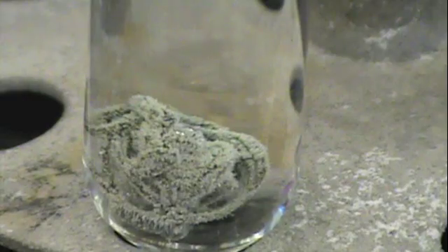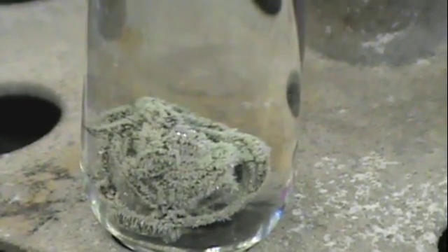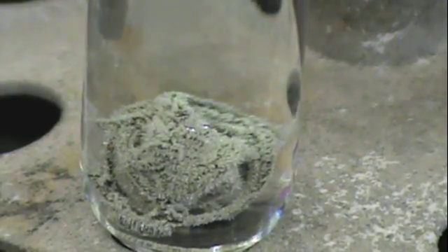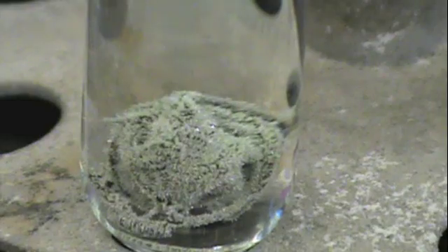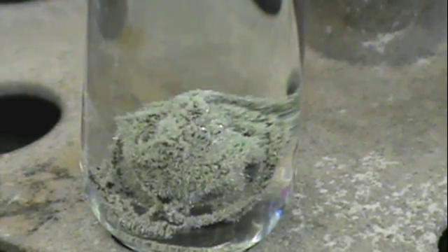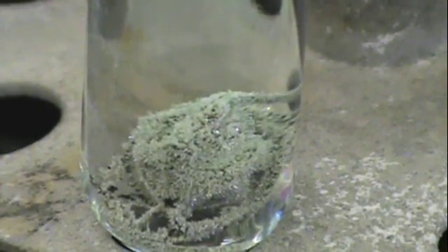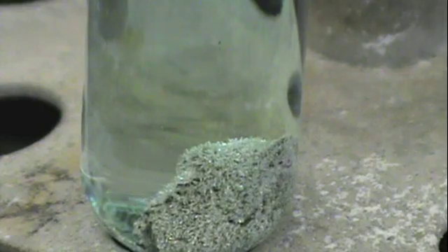You can also see, if you look closely, some streaks in the solution. That is the result of copper ions going into solution, as silver is deposited. Clearly, there is a reaction happening between copper and silver nitrate.